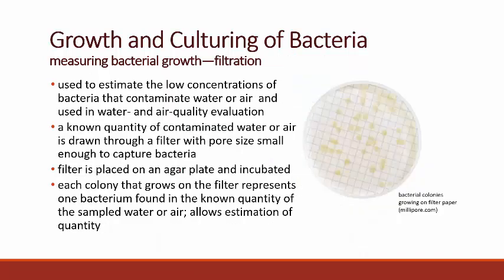Okay, another way, if you have low concentrations of bacteria in air or water, would be to filter a large volume of air or water through a specially designed paper filter that has a very tiny pore size. So you would push this known quantity of water or air through the filter, or draw it through, and it would capture bacteria on the filter.